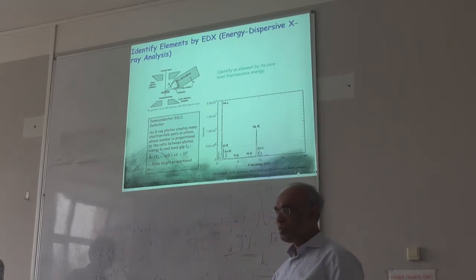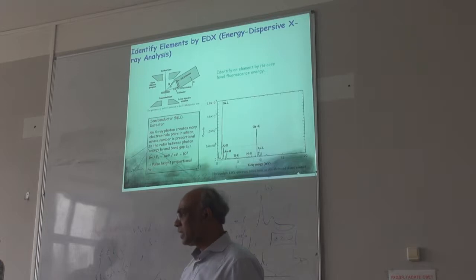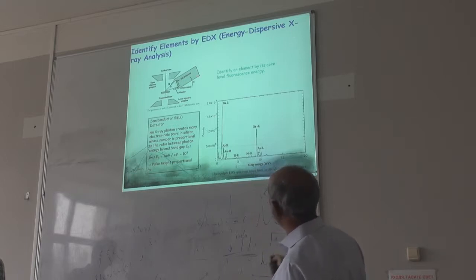elements are there. Suppose you make some, say, carbon structure, sometimes you may have some impurity, right? If it is maybe some boron or oxygen or phosphorus, we can look at those things using this EDAX. Sometimes they call it EDAX, sometimes EDS, different names. This is energy dispersive spectroscopy. This is actually X-ray with this one.